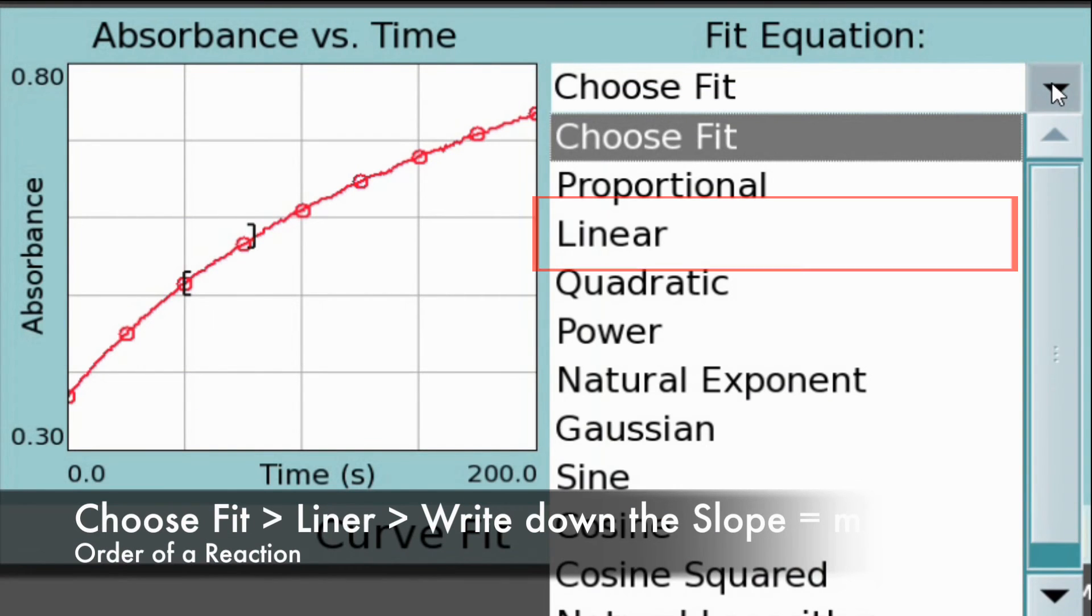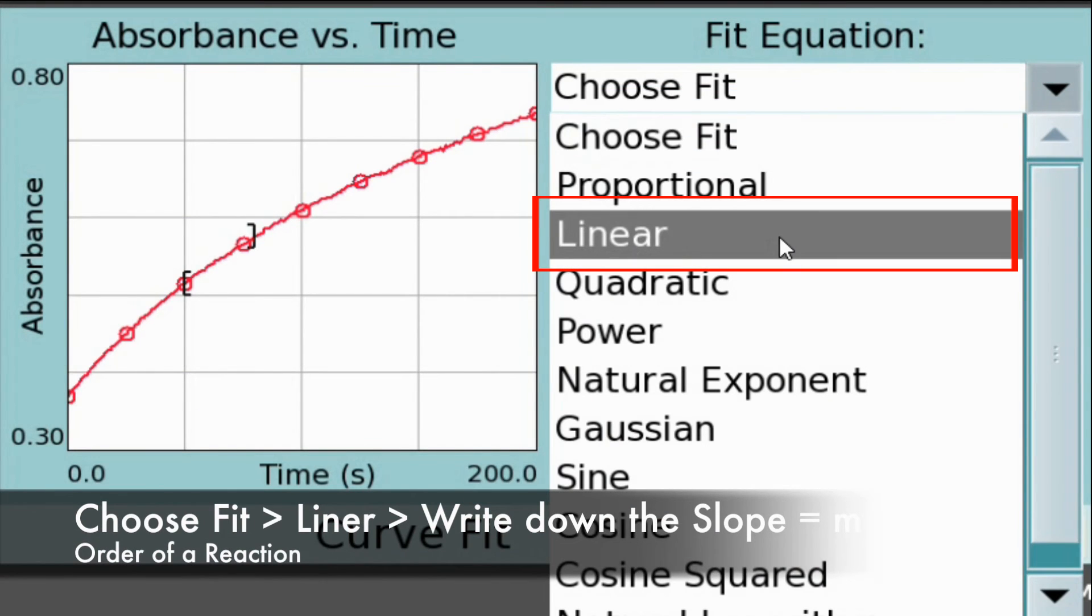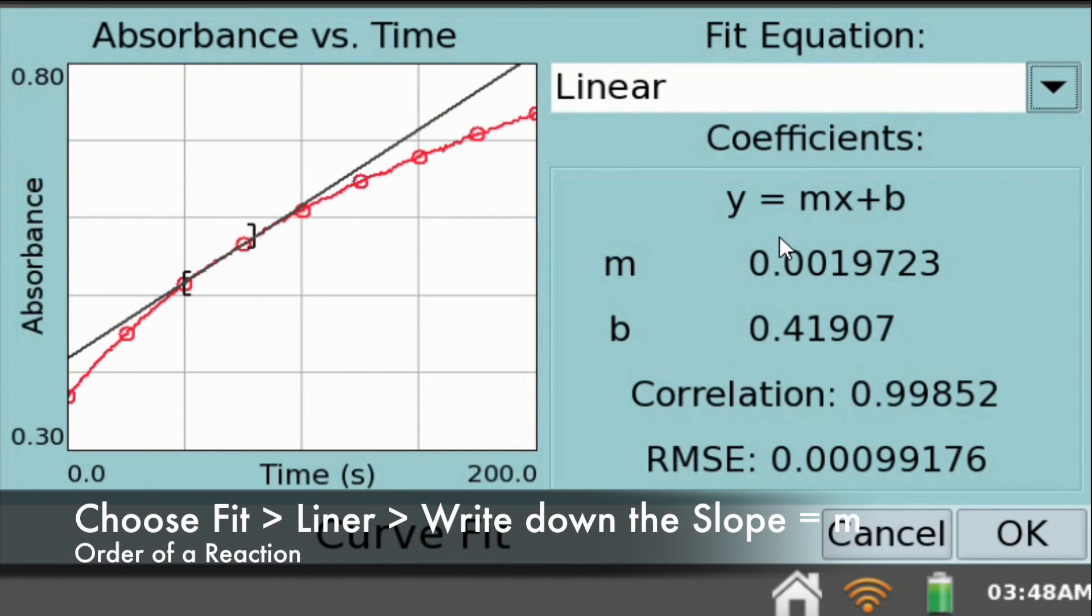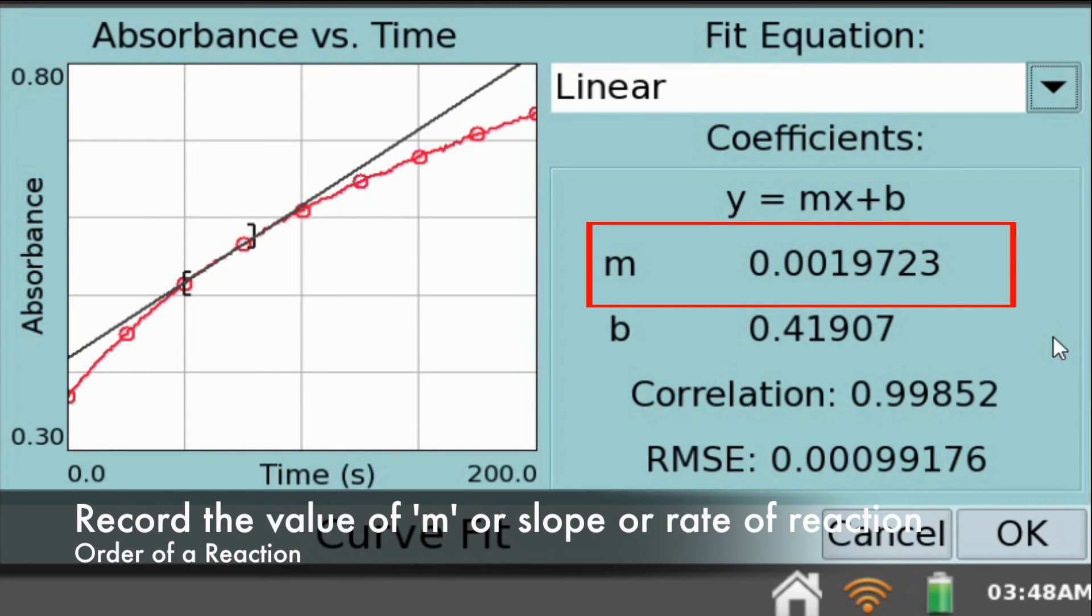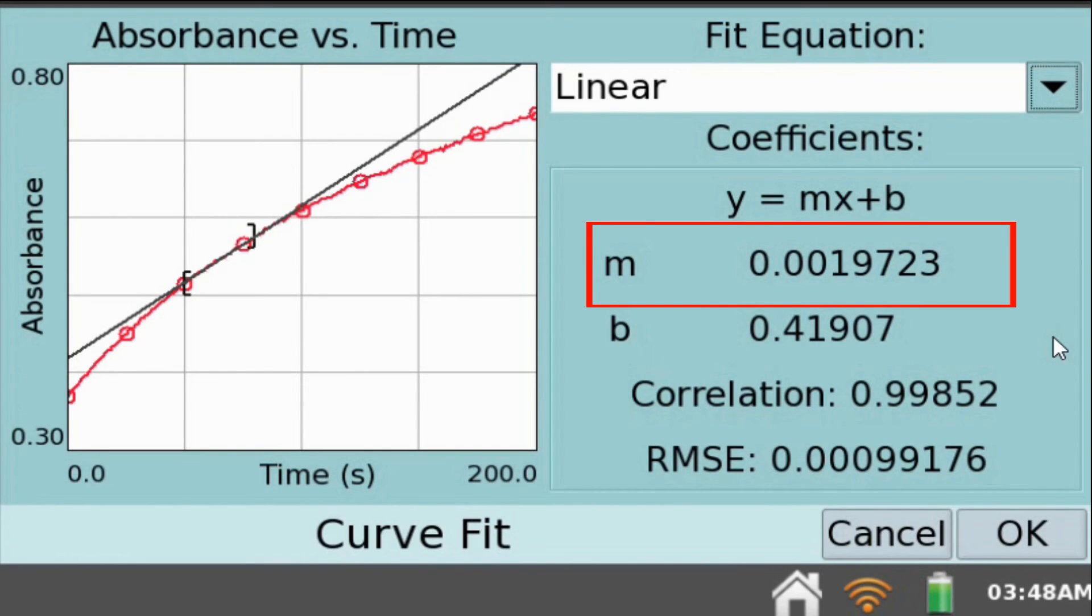From the drop down menu, select linear. This will give you the slope of the tangent. In this case, the value of m, or slope, or rate of reaction is equal to 0.0019723. Record this data on your data table under run 3.